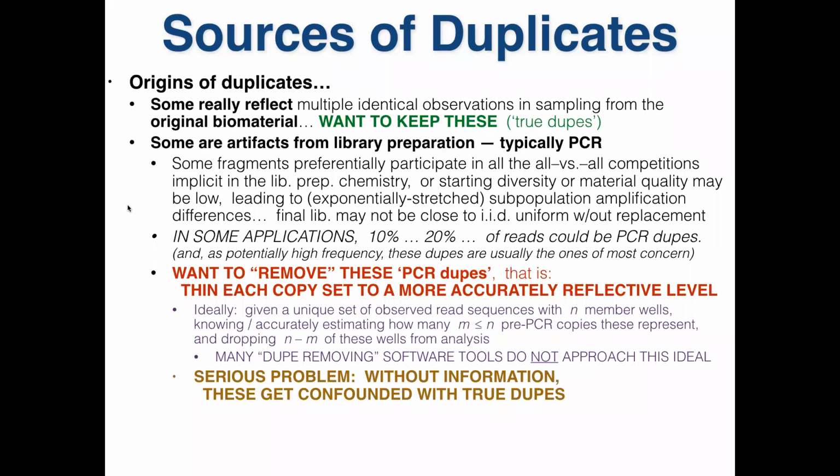With single-ended data, you really don't want to just take sequences that are literally identical, because then you very much expect to have repeated copies of that thing. And with the single-ended reads, you really don't have much to go on.